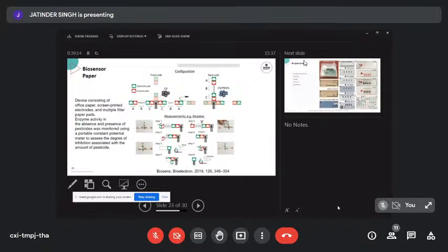We'll have a special session on paper microfluidics, but paper microfluidics has also been done with electrochemical detection. If you think this looks like origami, it is. It's microfluidic origami. The idea is that we can fold and open things to add reagents together. The important part, why I put a slide in here, is that this is a typical electrochemical detector.